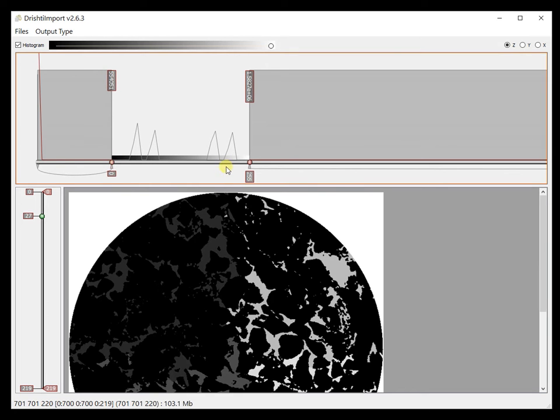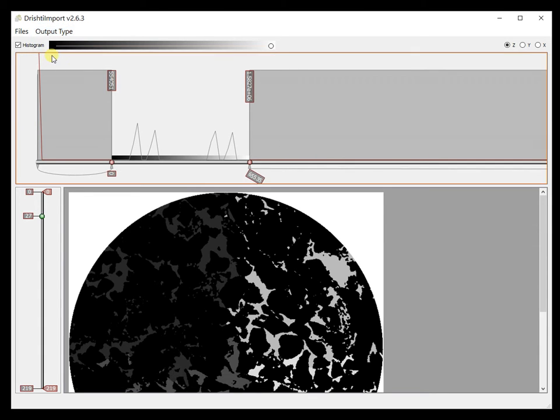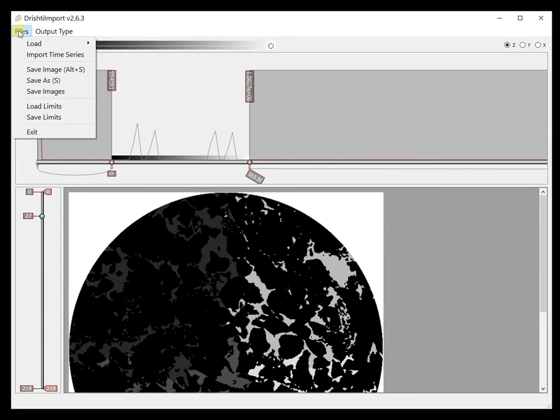So let's export that as 16-bit. By default it is 8-bit when you save the data to pvl.nc file, but let's save this data as 16-bit. So output type now is 16-bit and let's save that data.